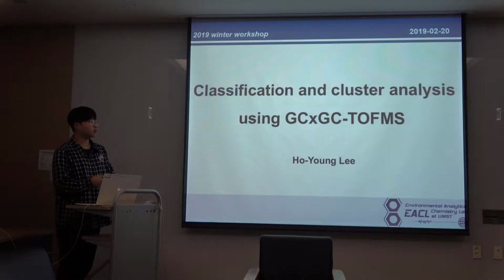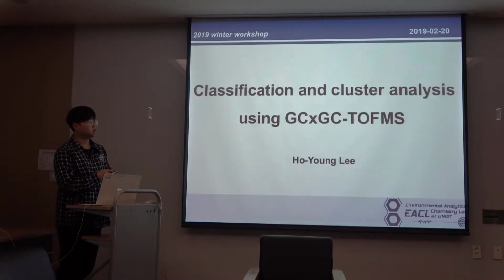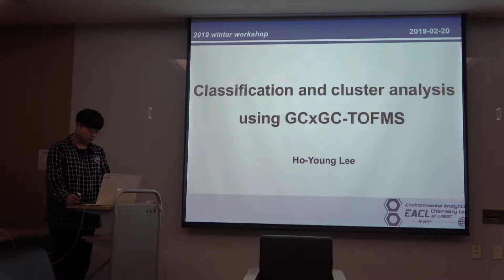Why I chose this paper: in the research of GC×GC-TOFMS, classification and cluster analysis are widely used for data processing, so I will briefly suggest these techniques.